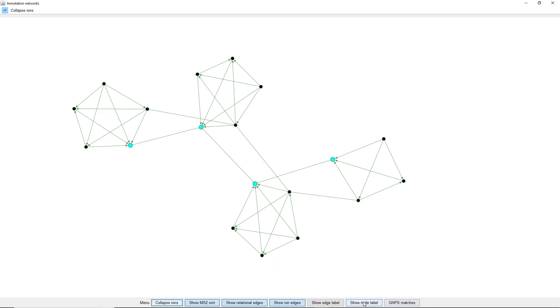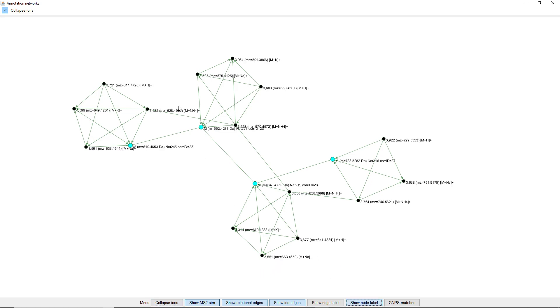We can show the labels again, and we can see they all make sense: M+H, M+ammonium, M+sodium, M+potassium — very similar on both sides. This also shows us that we might be correct with our assumption, because we have potassium, sodium, and ammonium ions — nothing weird.